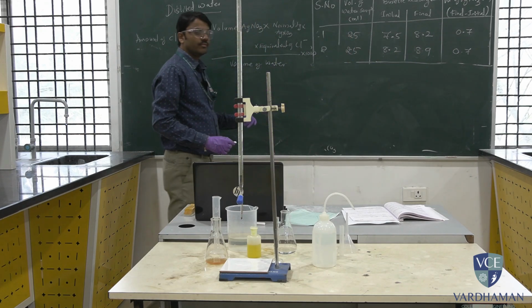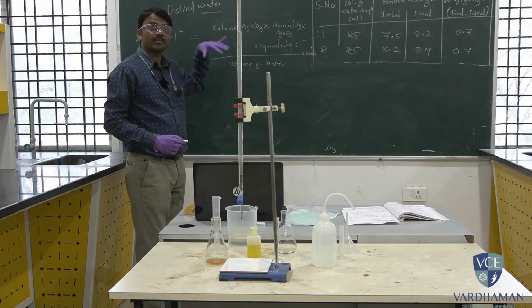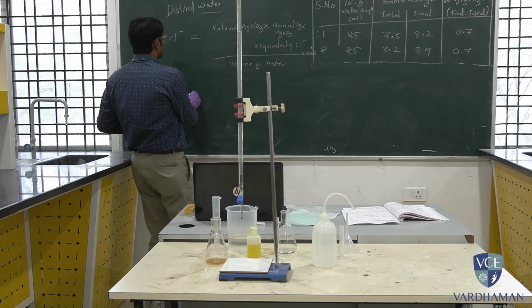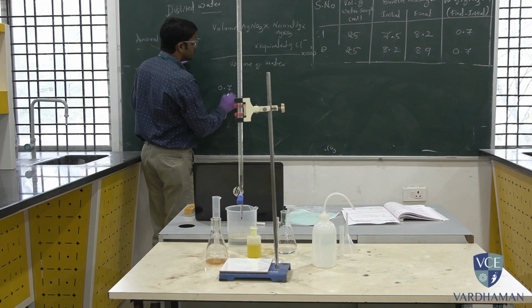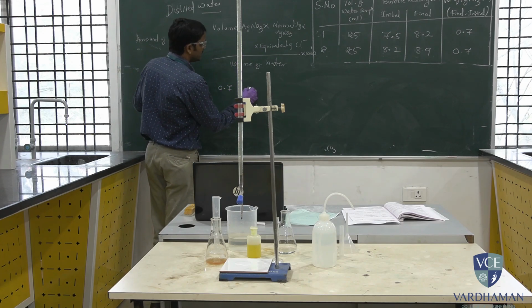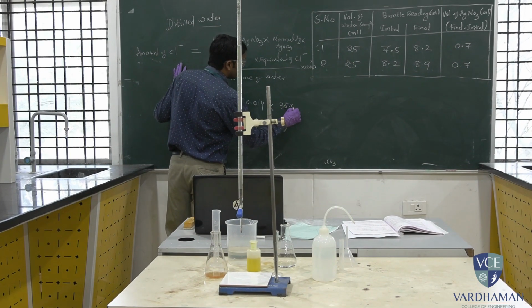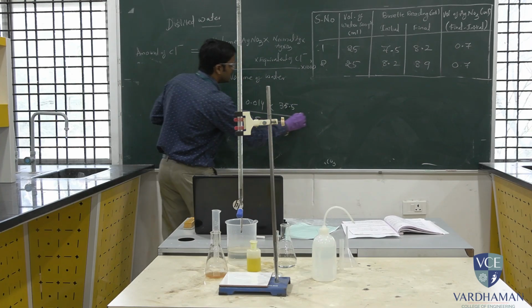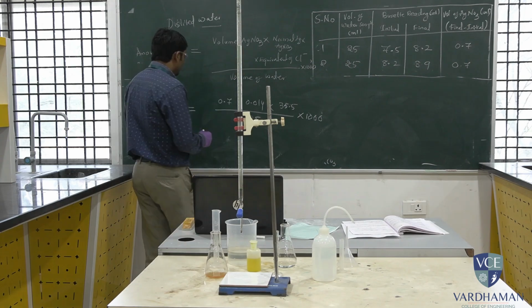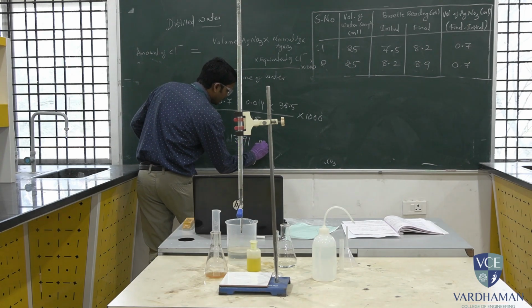Okay. Now we'll move into the calculation. How much chloride is present in the distilled water? The volume of silver nitrate consumed is 0.7, the normality is 0.014, the same, and the equivalent weight is 35.5. The volume we have taken is 25 ml, and multiply with 1000. So we'll get around 13.91 milligram per liter.